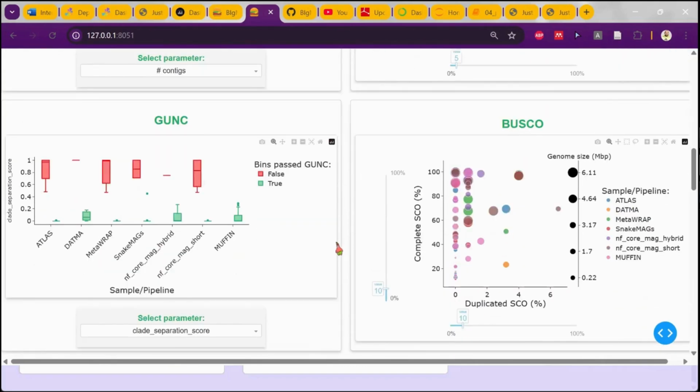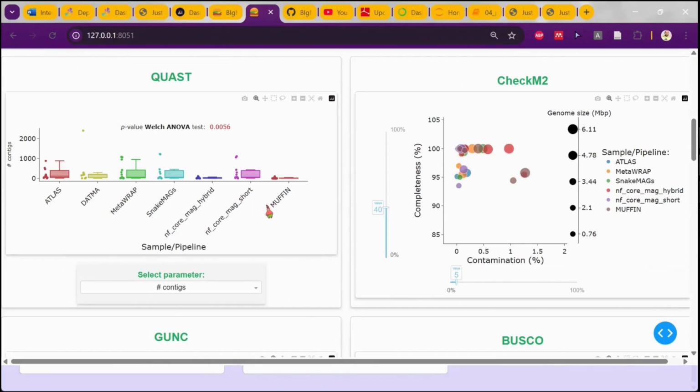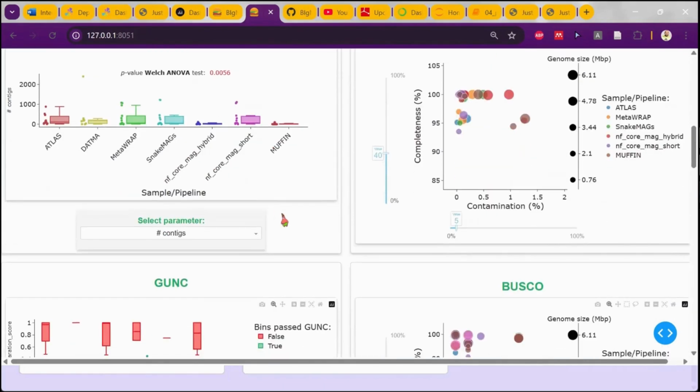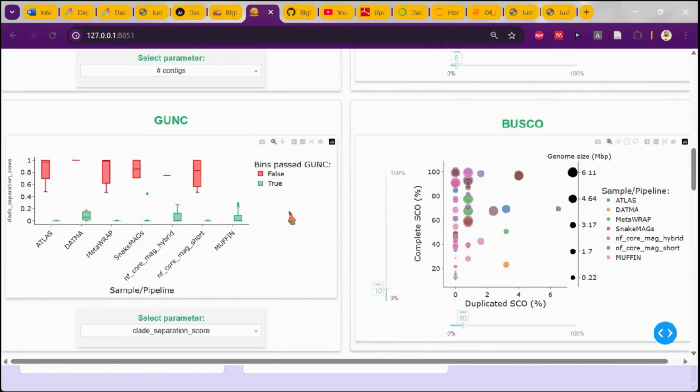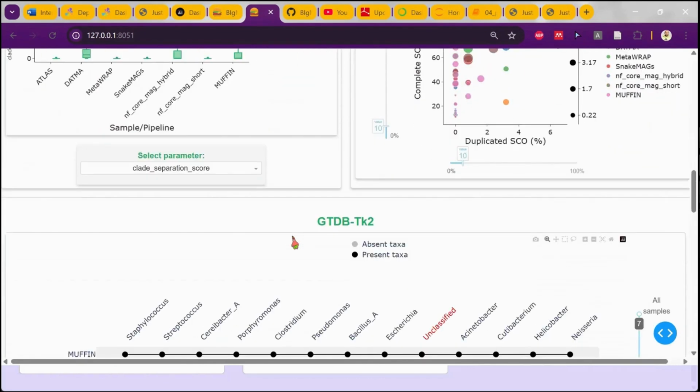Yeah, so as you can see, in the code that I'm going to show you in a bit, it becomes a bit messy, because I have to place each of the items, and for each of them I have to create a row, a column, and then within the same column another row. So it starts to be nested, but a bit messy. But it was the way that I wanted. I don't know if it was the most optimized way, but at the end I obtained the result that I wanted.